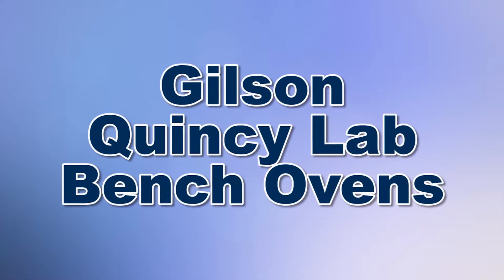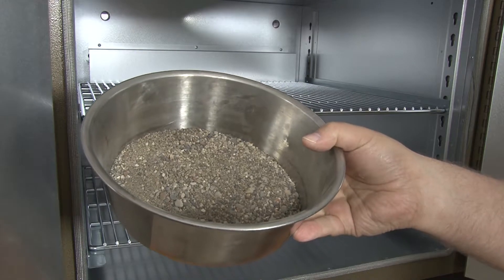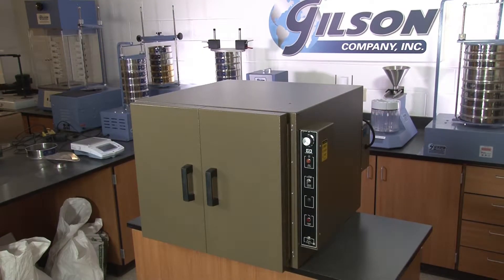When you need to preheat, thermal test, dry, cure, and dehydrate various types of soils and aggregates, then Gilson is your best choice.